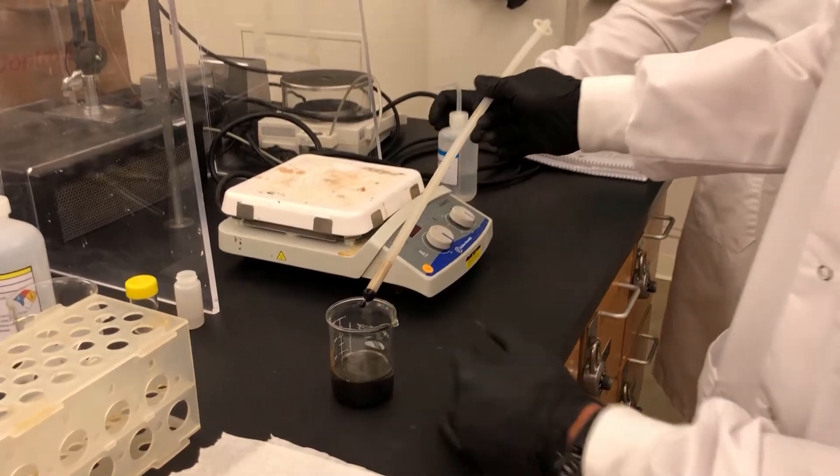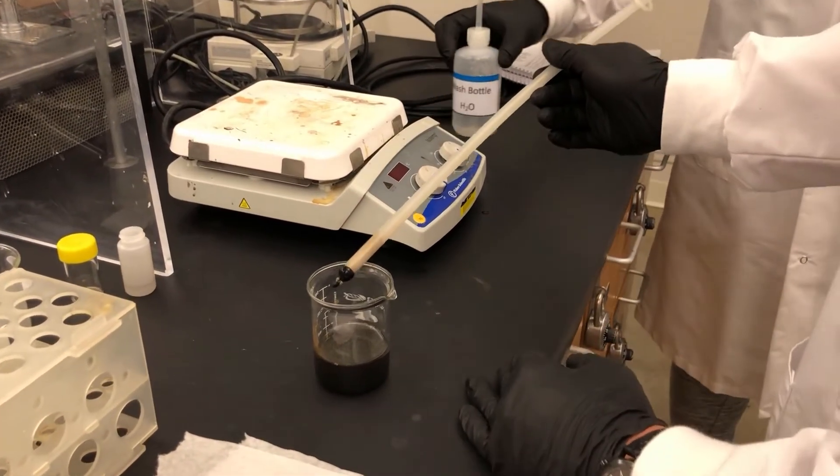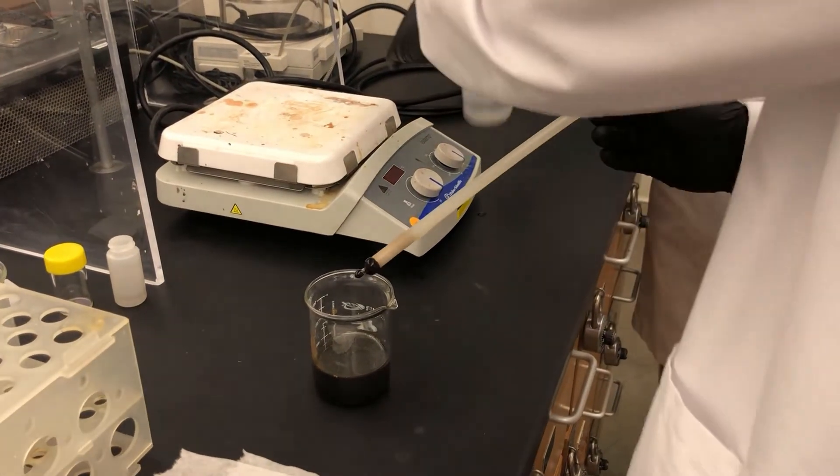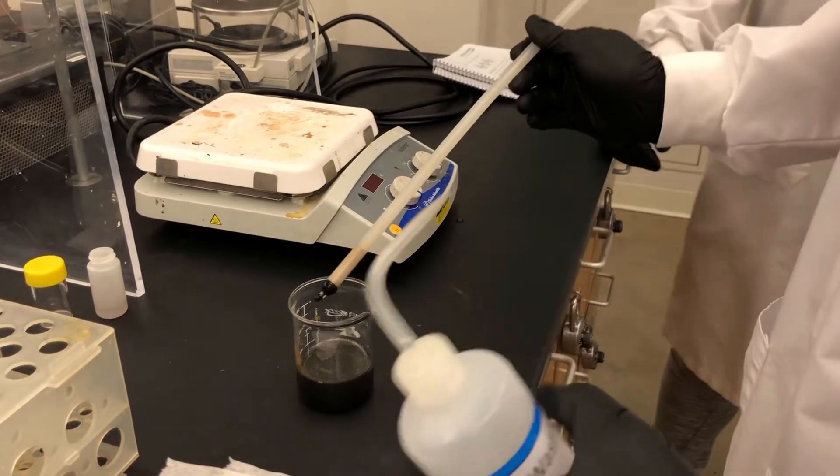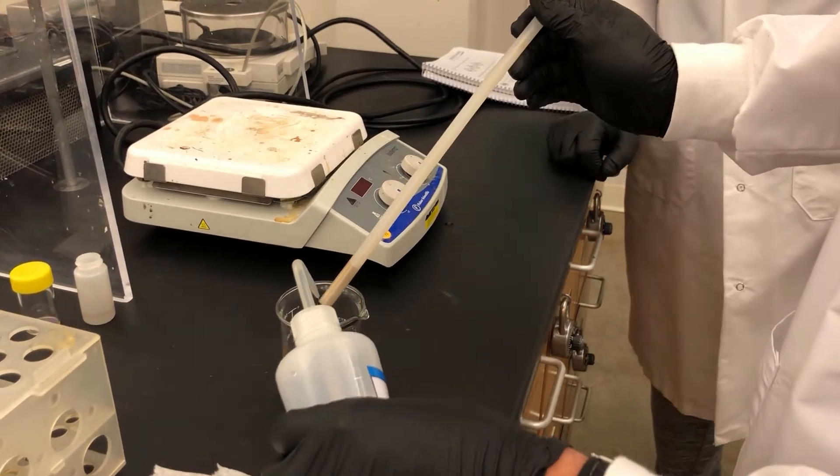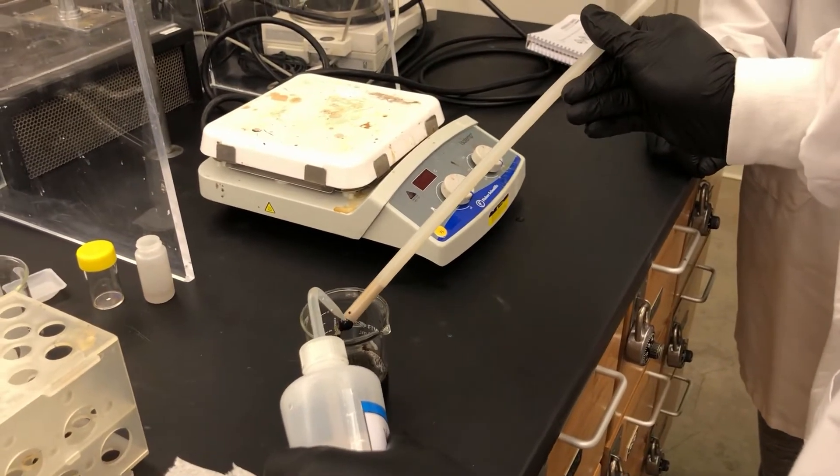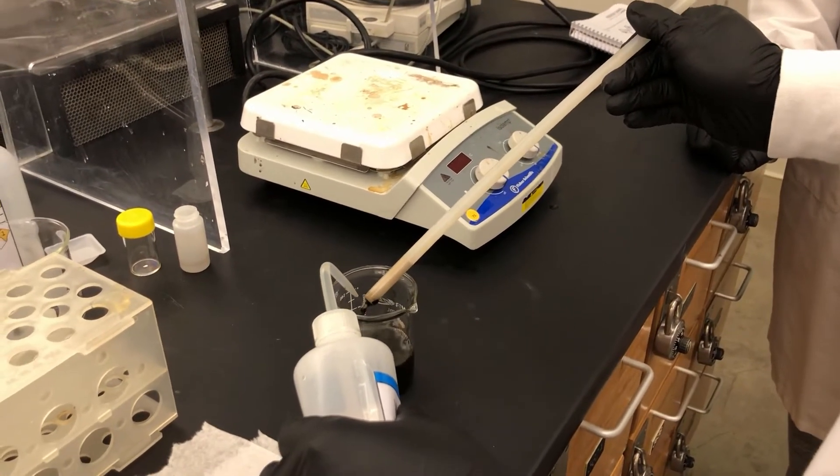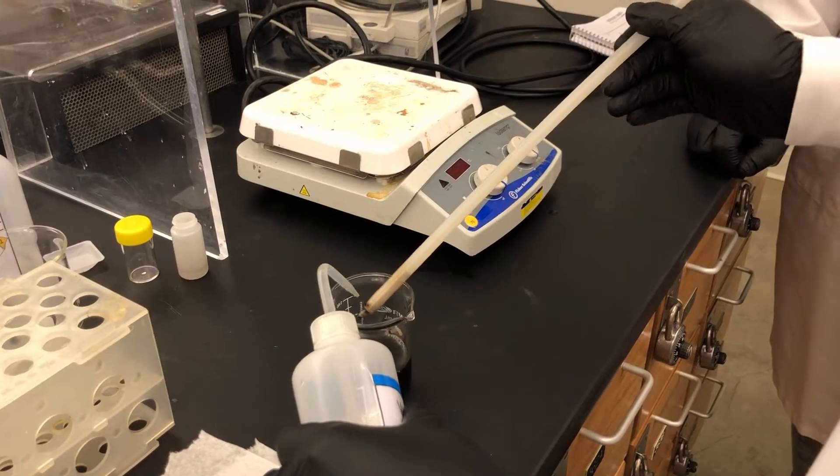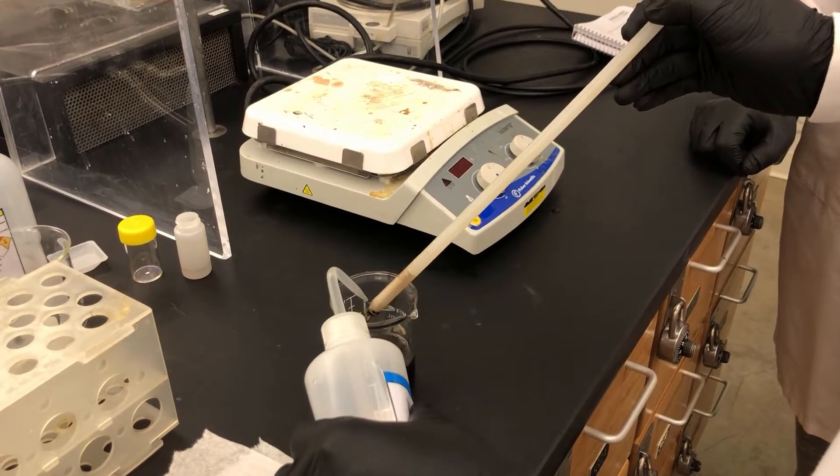So I'm going to take this away and pull out my micro stir bar with this magnetic wand. There it is. As you can tell, some of these iron nanoparticles are now attaching to my magnetic wand. So I'm just going to rinse it off with some distilled water. Try and get that as clean as possible.